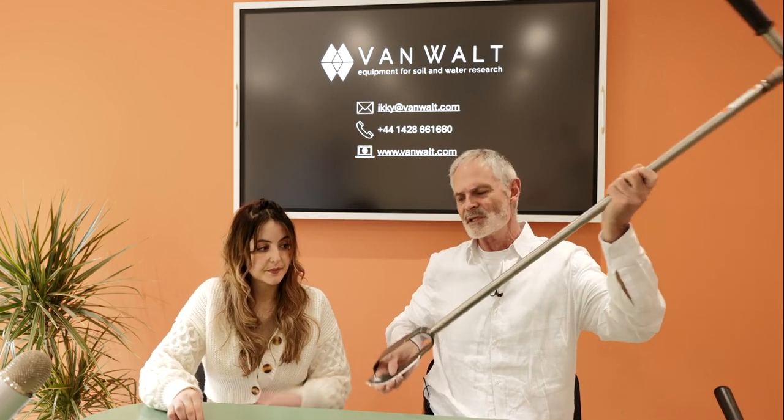So 1.2 metres. I just want to point out here that the handle is actually disconnectable. Despite that, we call this a one-piece auger, and the reason we disconnect is that they're much easier to pack. For shipping, it's a lot easier to disconnect the handle. Just to point out, this uses a completely different connection. It's not extendable. It really is a single piece, and that just comes apart for transport.